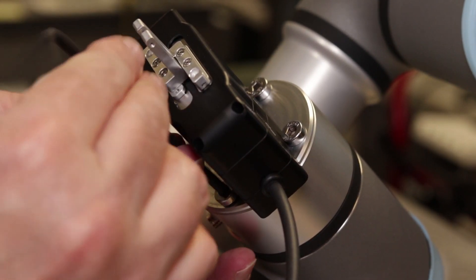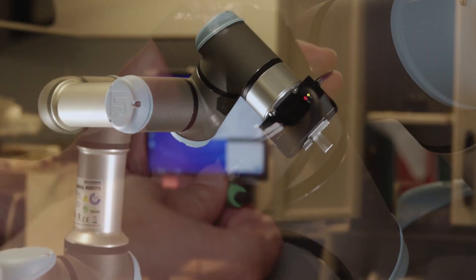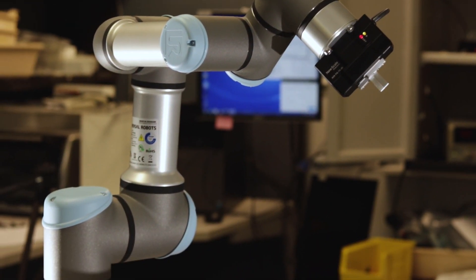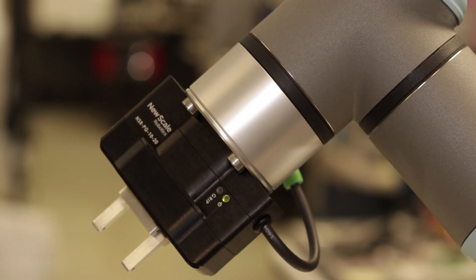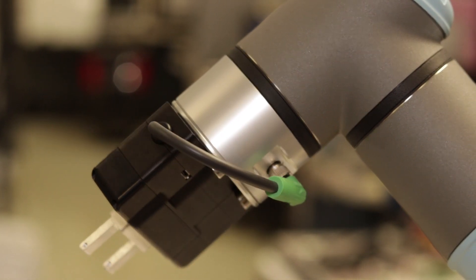Attachment to the UR robotic arm only takes 4 screws and a single I.O. connection. There are no other wires or external controller needed. This single connection allows the gripper to continuously move 360 degrees at the end of the arm.